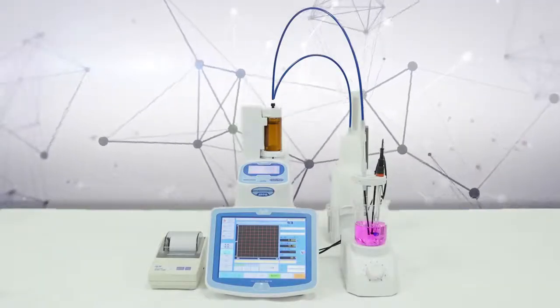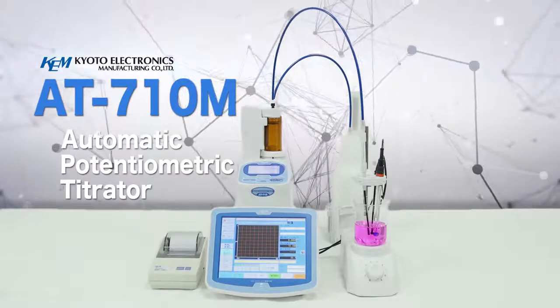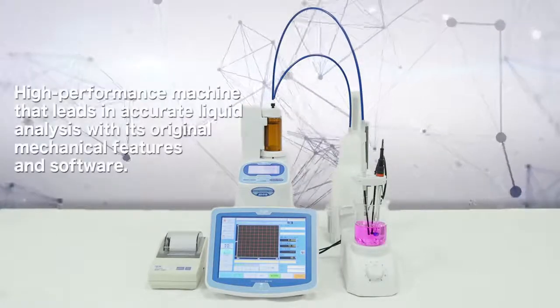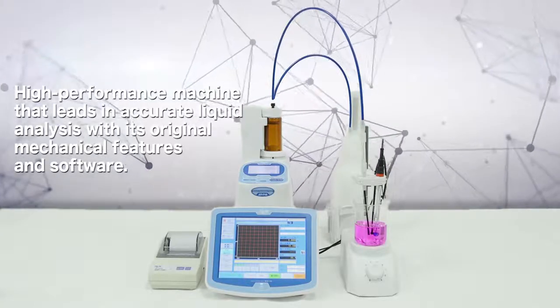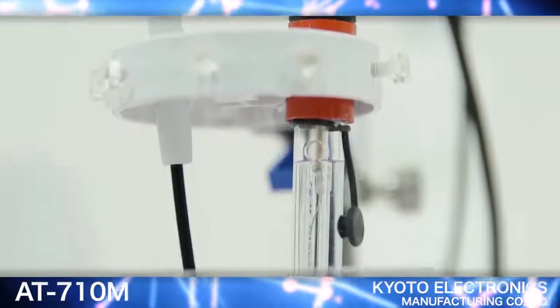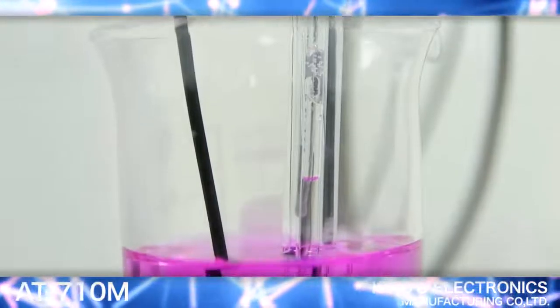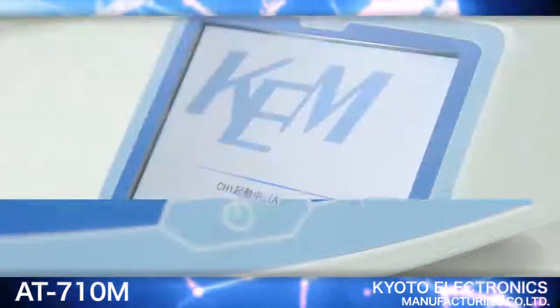Automatic Potentiometric Titrator AT710M. The AT710M is a high-performance instrument that leads accurate liquid analysis with its original mechanical features and software. In addition to measuring acidity and salinity, it is an AT series automatic potentiometric titrator which can be used for various types of concentration analysis.